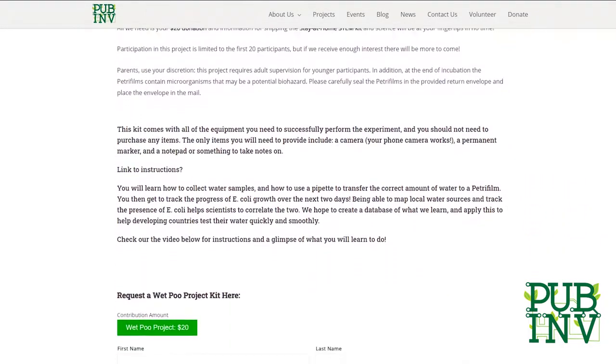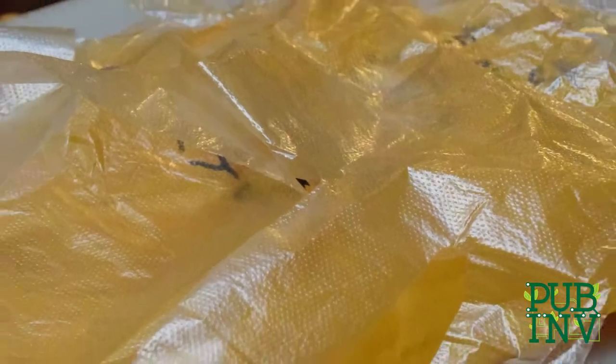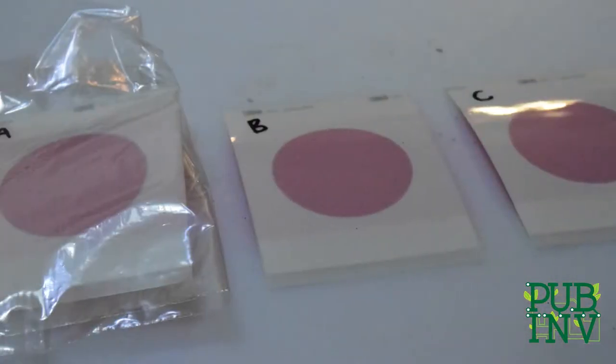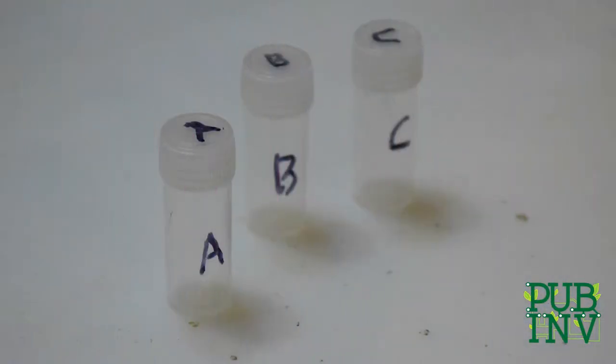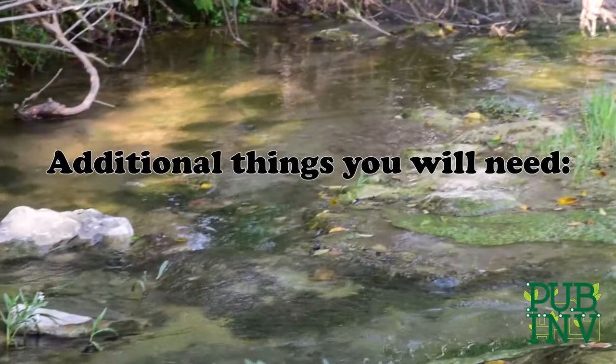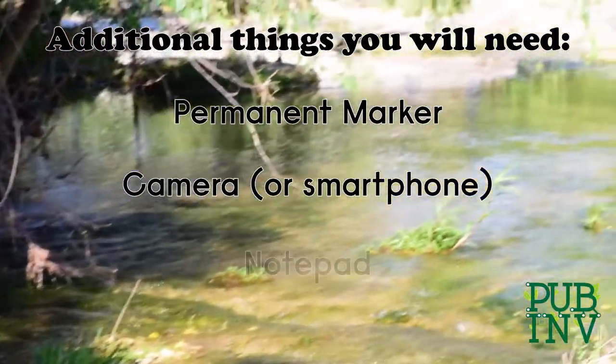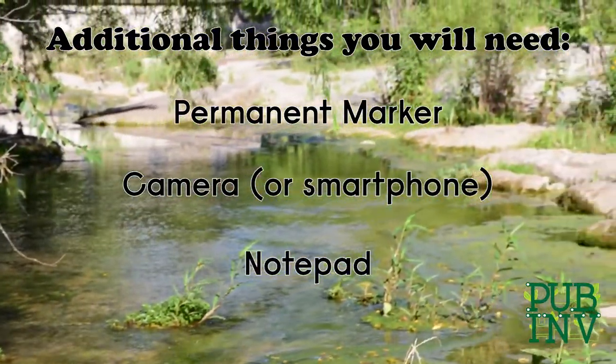If you've ordered the kit from the Public Invention website, your kit should include the following: 2 pairs of gloves, 3 pipettes, 3 petri films, 3 5 mL sample vials, and 1 pre-addressed gray envelope for sending your results back. You will also need a permanent marker, a camera for documentation, smartphone will work, and a notepad to write down where you collected your water samples.